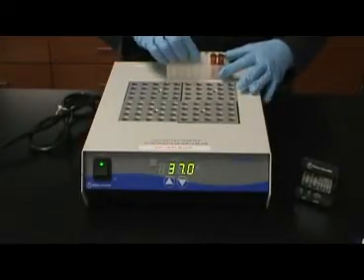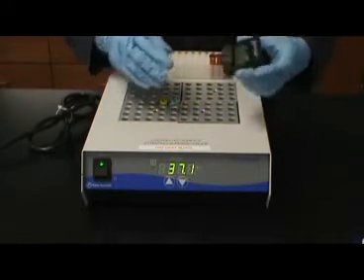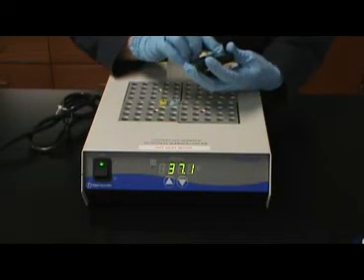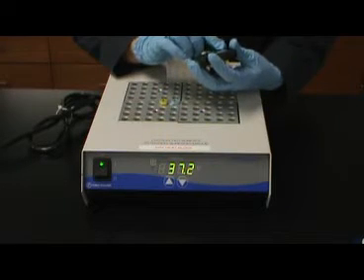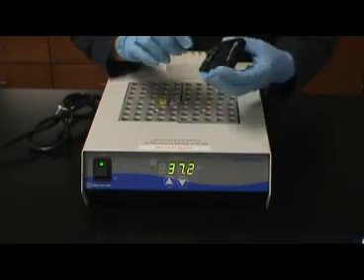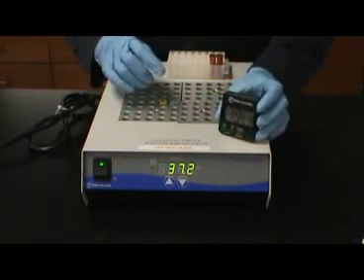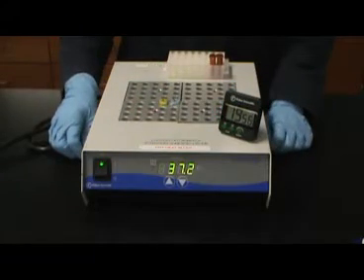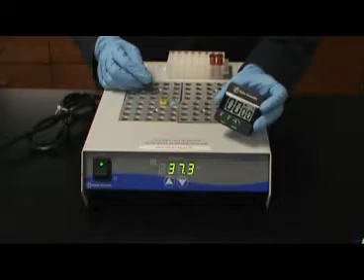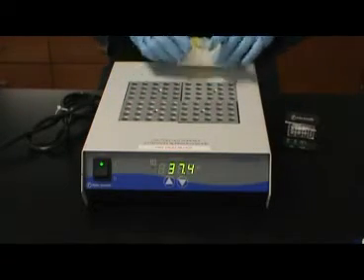After the tubes have been mixed, they will be transferred to a heat block or water bath set to 37 degrees Celsius. They should remain in the heat block or water bath for approximately 20 minutes. It is during this time, again, that the transcription and translation of the pUC18 plasmid will begin. Once the timer has gone off, remove the tubes from the heat block.